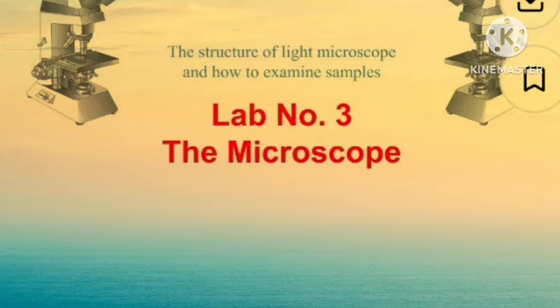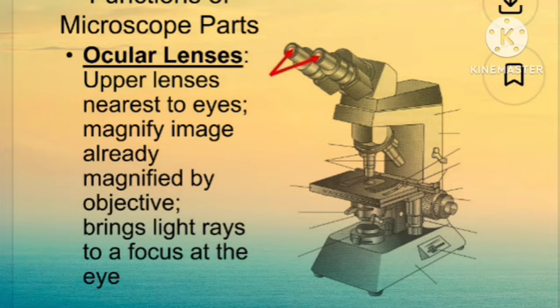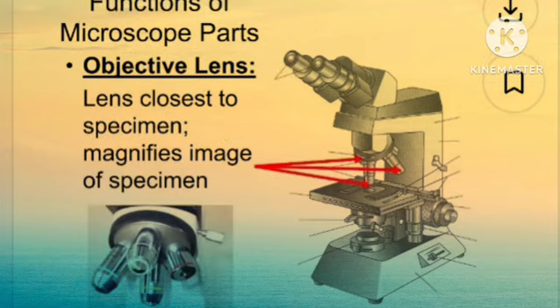And next, microscope parts. What are they? Ocular lenses, the very important structural and mechanical components. Ocular lens, the eyepiece. What is it? The lens at the top of the microscope that you look through, which typically provides 10x magnification.